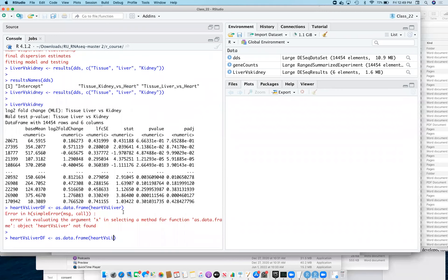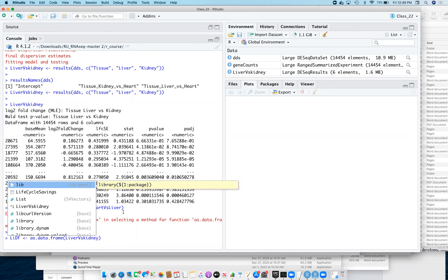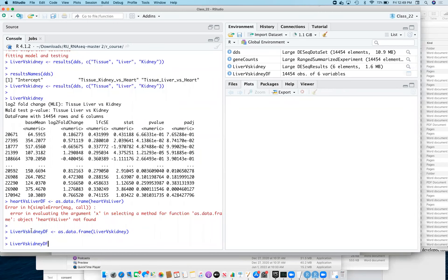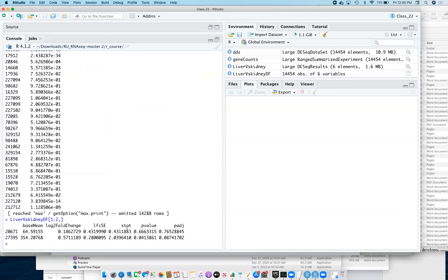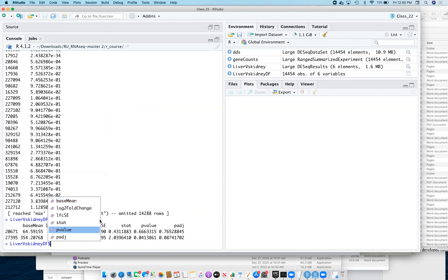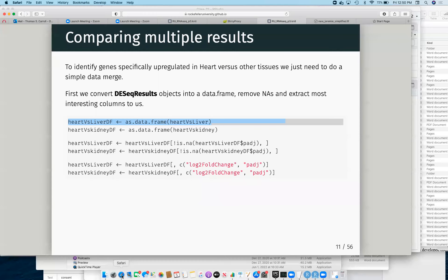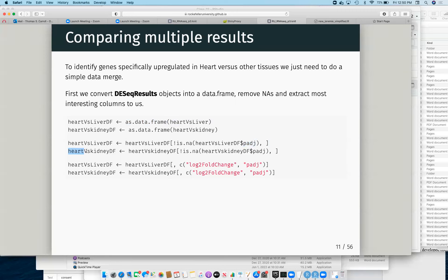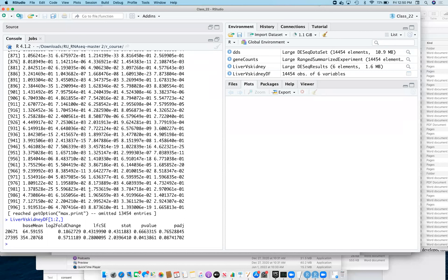Let's do the liver comparison. From that we can do all the standard accesses like accessing columns or subsetting. One thing we always do when we get these objects is — unless we are filling in the p-values like we showed you last time — typically we have NA for p-adjusted values where the gene was very low expressed. This is how DESeq2 filters for its multiple discovery rate correction. So we can look at how many genes actually had an NA p-adjusted value.